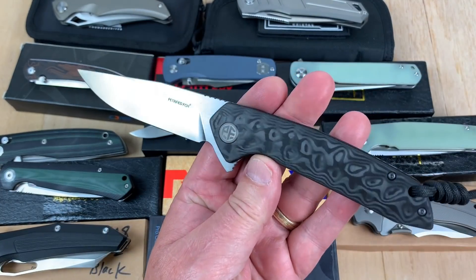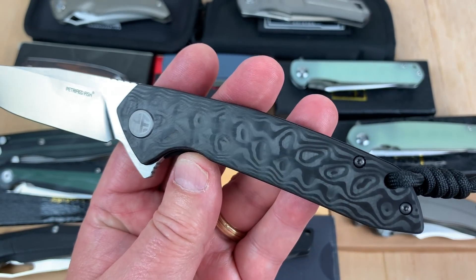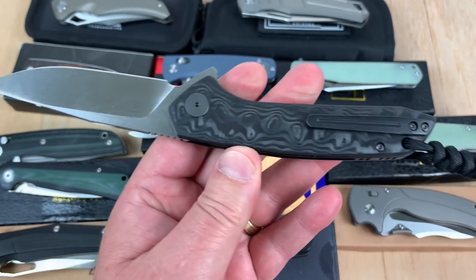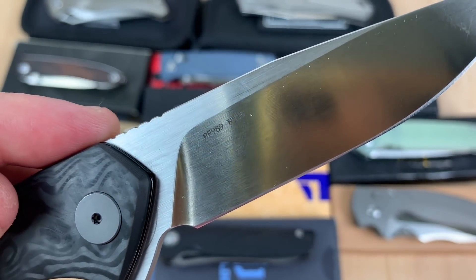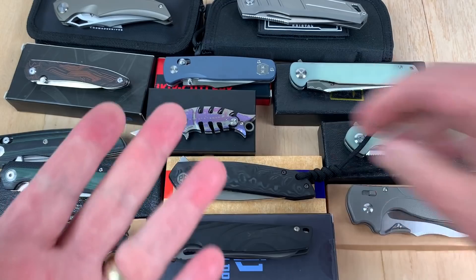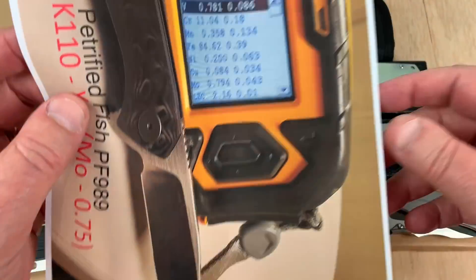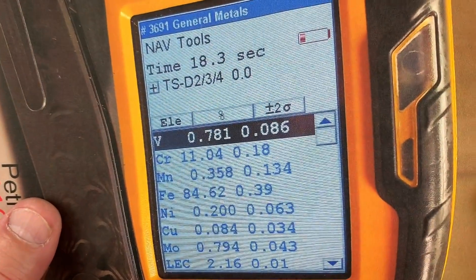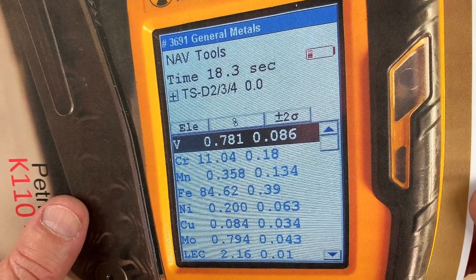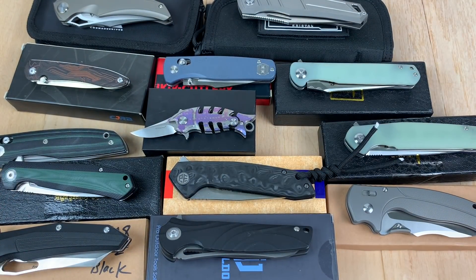Next one is also Petrified Fish — the PF989 in Böhler K110, which is basically D2. Check that out — it almost looks like raindrop Damascus, but it's carbon fiber with a titanium pocket clip and they even put a little lanyard on there. I did a video on this one. Is it really K110? Yes it is. Read them and weep — vanadium levels almost 0.8, and chromium a little lower than 12, but D2 is a semi-stainless, not a full stainless.